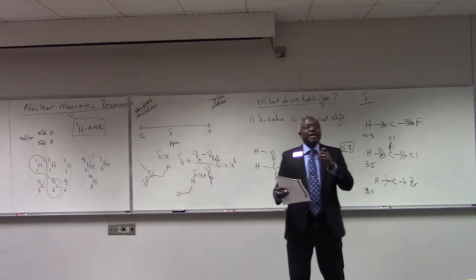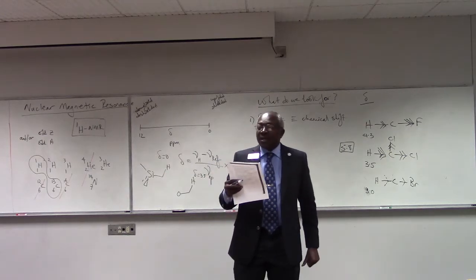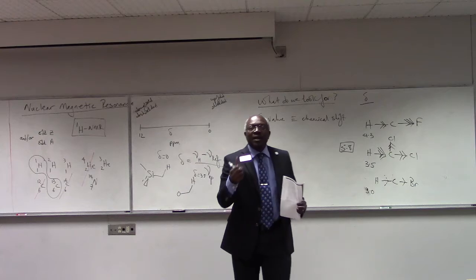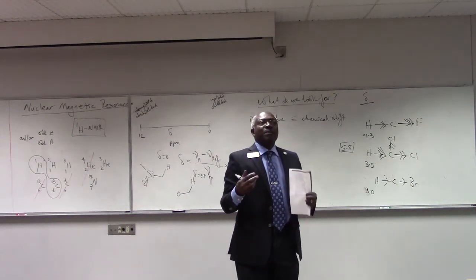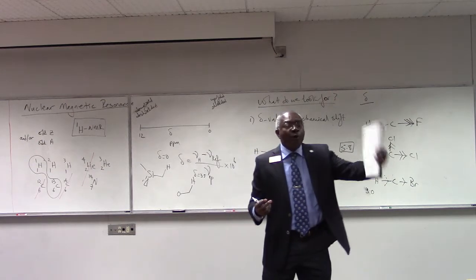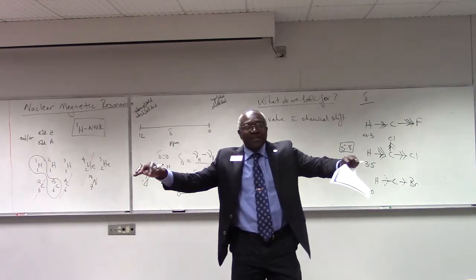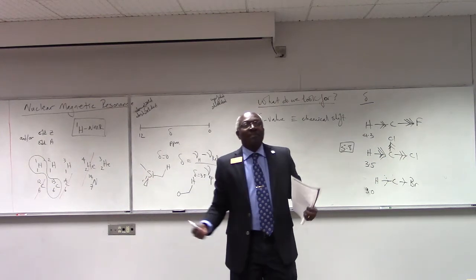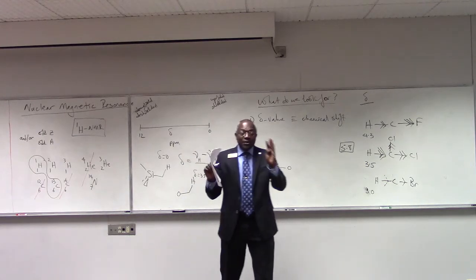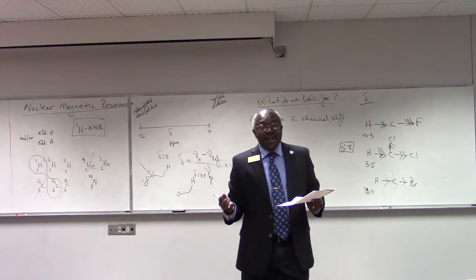Okay? So the chemical shift is a tattletale as to what environment the protons are in. Now, I would make the point that the combination of which heteroatom, how many of them, and where they are, because there are multiple factors all operational simultaneously, it is possible for an H in one environment to have exactly the same chemical shift as an H in a different environment, because the confluence of factors work out in that way, right? And so that does make HNMR a bit more difficult, particularly because the spectral window is so narrow. 0 to 12 is actually very narrow, and so the likelihood of protons overlapping is actually quite significant.